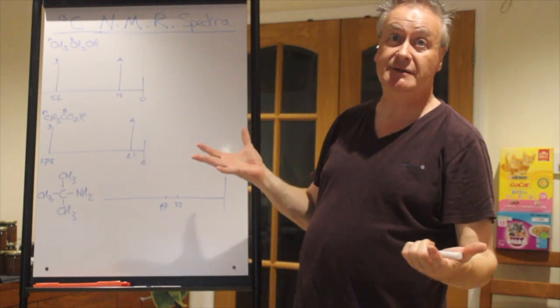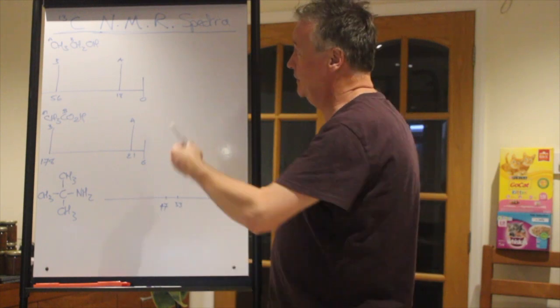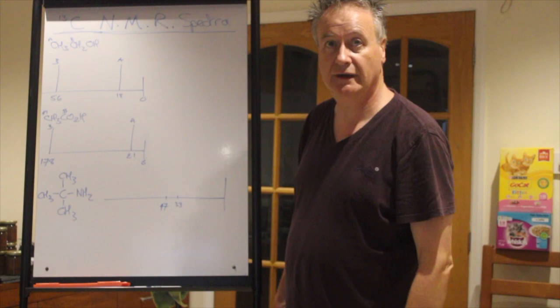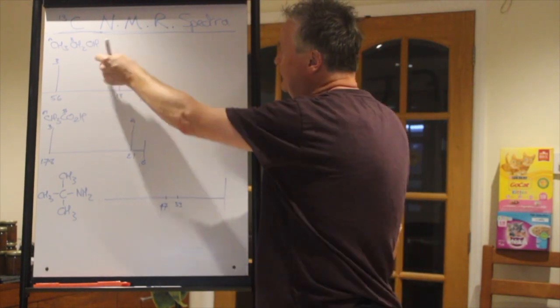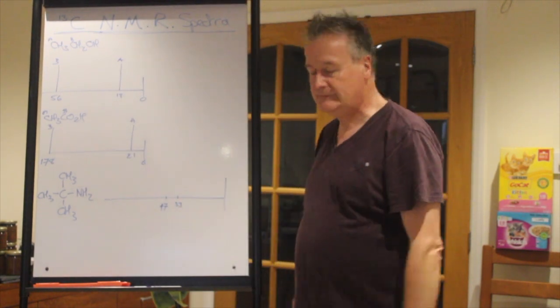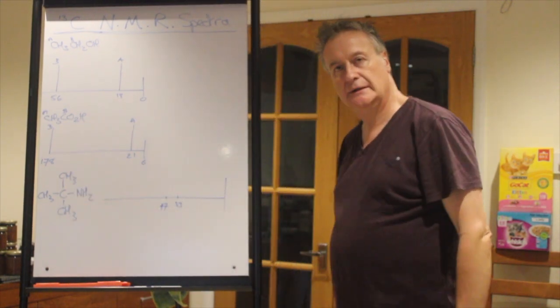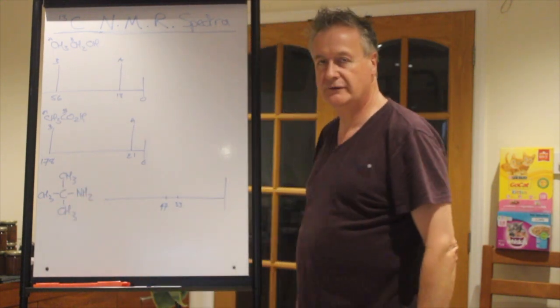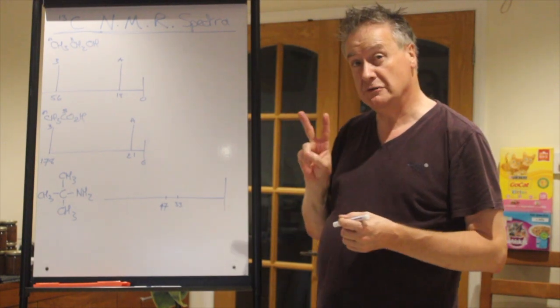So a very simple question would be, here's 2, which one is an alcohol, which one is a carboxylic acid? That one's a carboxylic, and you can count the carbons and say which carboxylic acid it is, because it's got to be ethanoic acid, there's only 2 carbons. It's got to be ethanol, there's only 2 carbons. Now we come to this one here. This is not one of my ones from earlier. This is an amine, where the amine is attached to the central carbon with 3 CH3s around it. And when you look at that, there are only 2 environments.